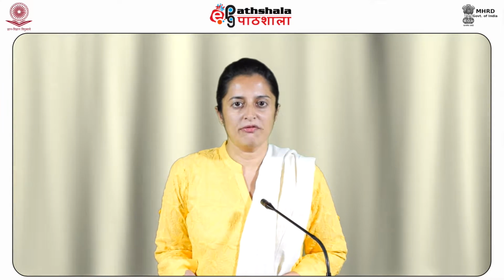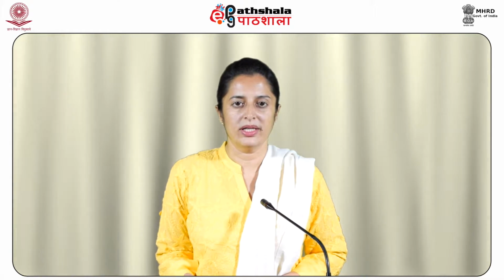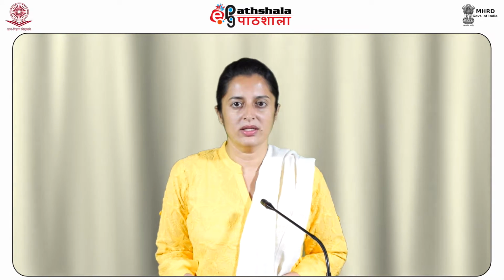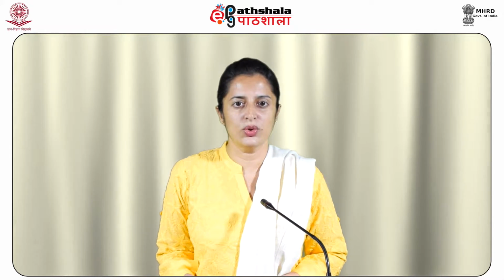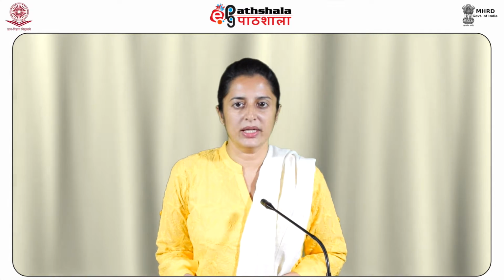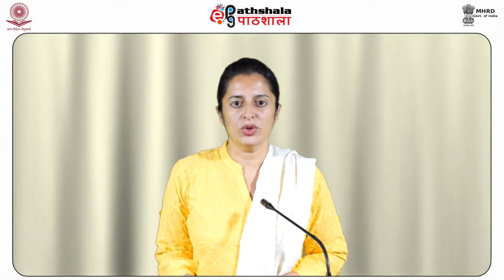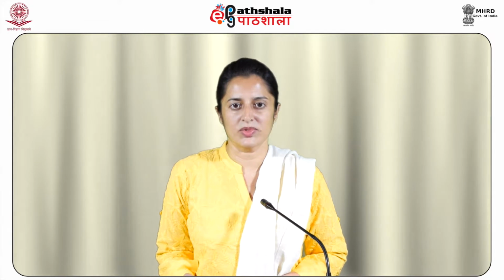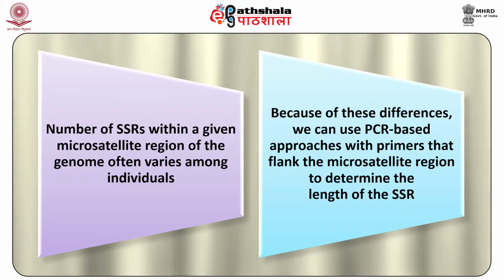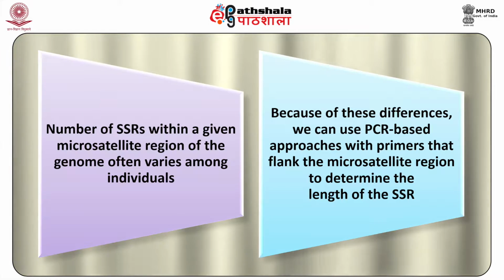As opposed to RFLP analysis, the second DNA fingerprinting technique focuses on microsatellite regions of the genome that contain simple sequence repeats, that is SSRs, which are short stretches of 2 to 6 nucleotides that are repeated multiple times. Most often, SSRs consist of 2 or 3 nucleotides, for example, CA, CA, CA repeated many times. The number of SSRs within a given microsatellite region of the genome often varies among individuals.